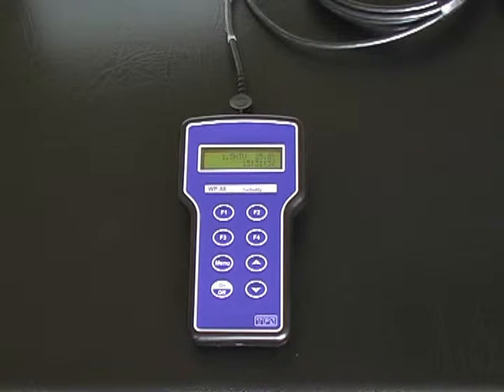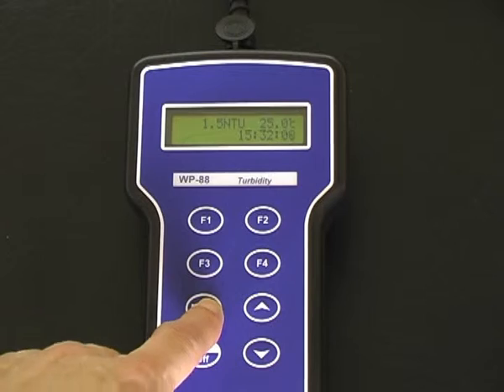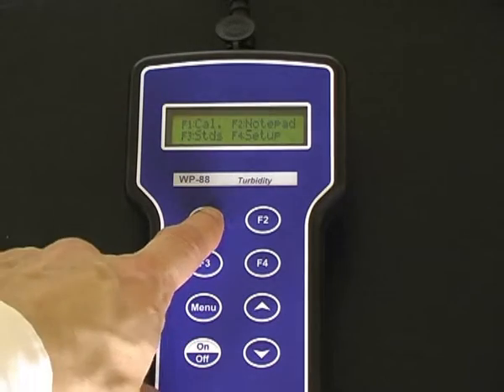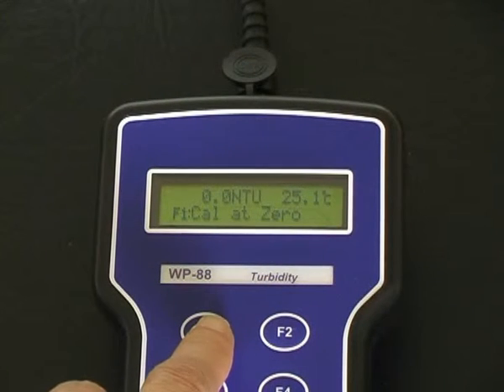To calibrate a TPS WP88 turbidity meter, the procedure is the same as for the TPS 90 FLT. Press menu first, and F1 to calibrate. Press F1 to accept the calibration instead of enter.